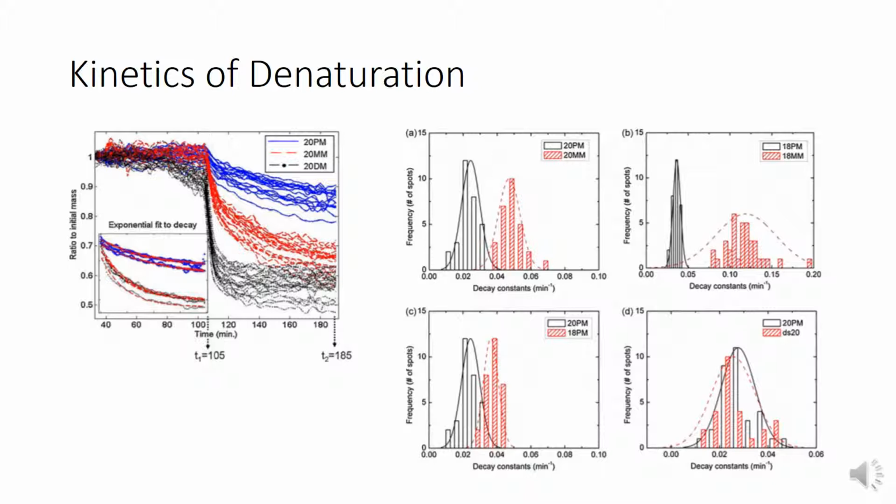And this also shows that the SPIR method can, in fact, determine stability and binding of these different duplexes.